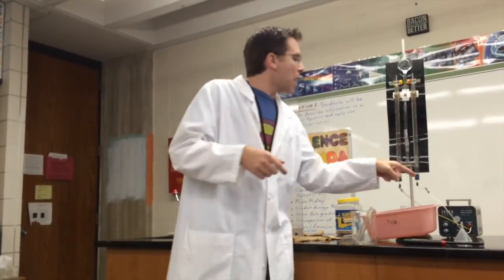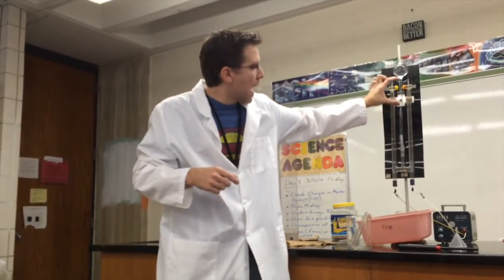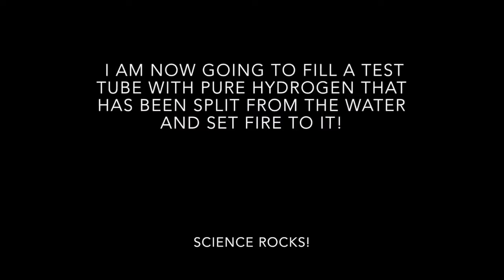We have here the Hoffman apparatus. The Hoffman apparatus is splitting water into its pieces. We have water inside, and we have a little bit of a catalyst, sulfuric acid, to actually aid the reaction. We have a positive and negative terminal attached, and we have hydrogen forming over here, and oxygen over here.